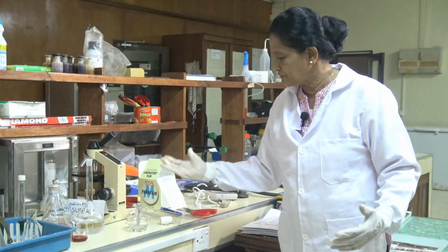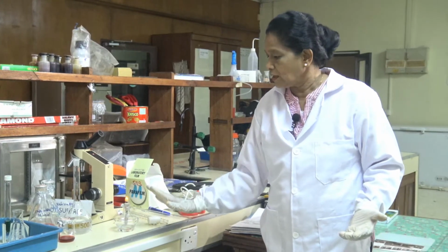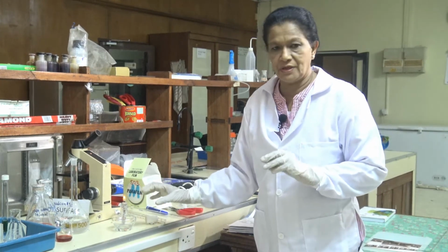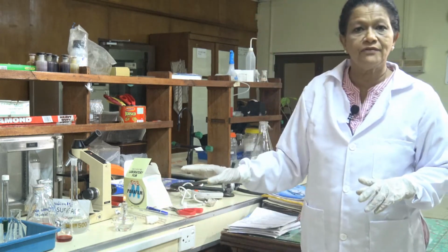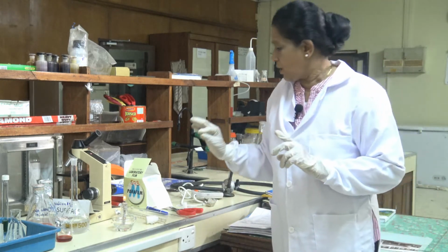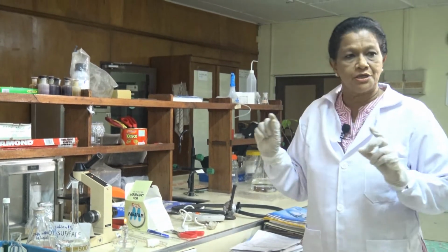Since this gives an open flame, you should not leave the open flame unattended, and do not leave the laboratory when the burner is on, and always keep in mind to shut off the main gas valve when the burner use is complete.